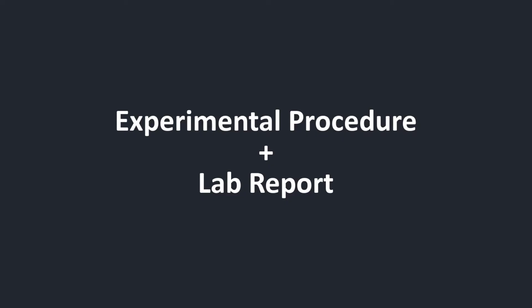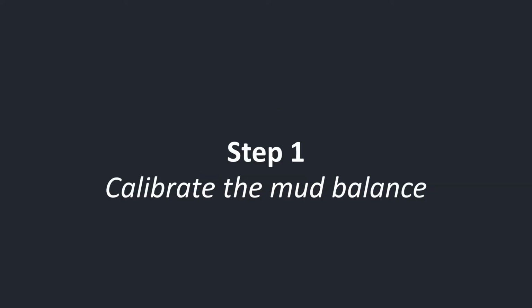In this video, we will describe the procedure for the rheological characterization of water-based drilling fluids experiment, as well as the lab report requirements. First, calibrate the mud balance with tap water at room temperature.